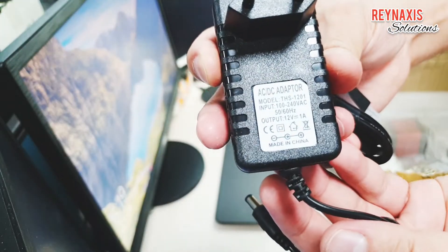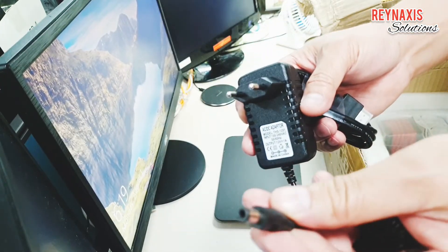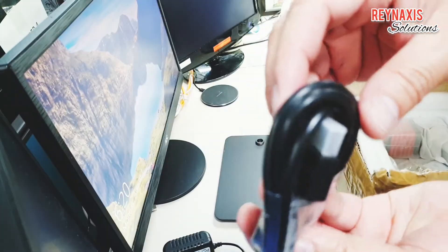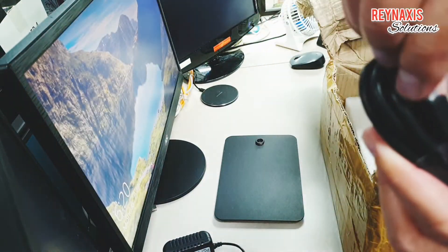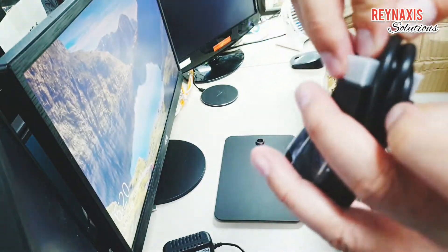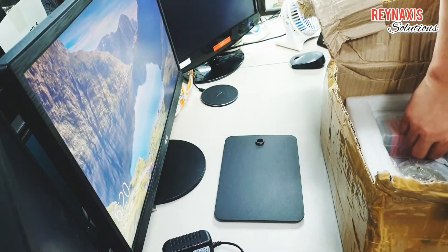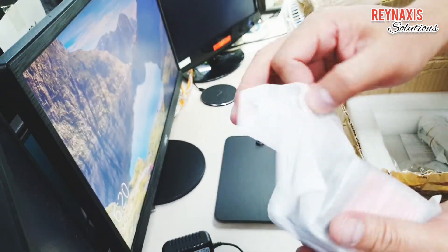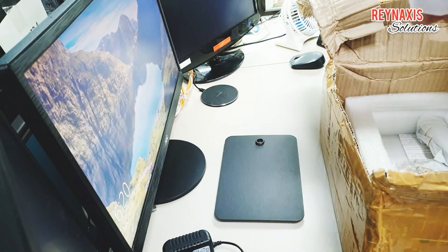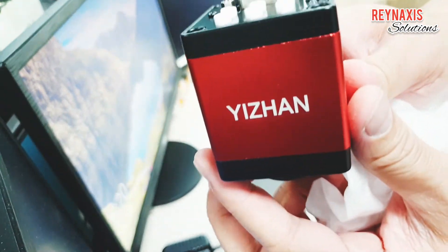This is powered by a 12-volt adapter and the input is 220 volts. It also comes with an HDMI connector, but it does not come with a VGA connector cable. However, this Kuaiku or IIZAN digital microscope can accommodate both a VGA cable and an HDMI cable.